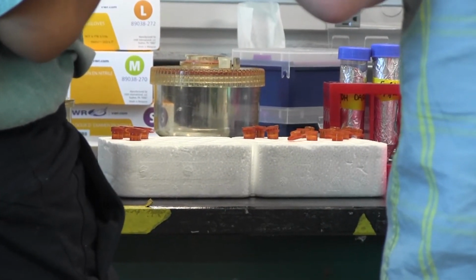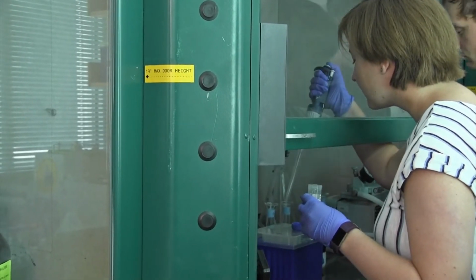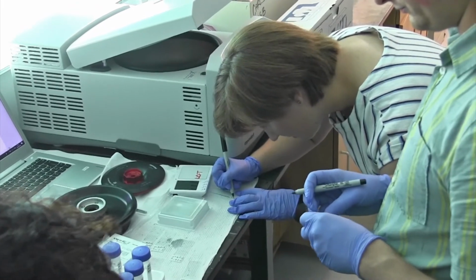Then once all the water is filtered through, we then put the DAPI stain on, and this is a 5 nanogram per microliter or a 5 microgram per mil solution that we put on the filter. We stain for 3 minutes, we vacuum it through, then we can mount the slides. So the students have been mounting the slides.